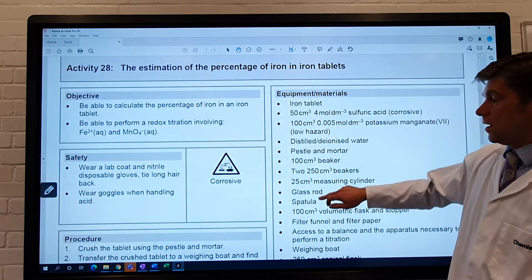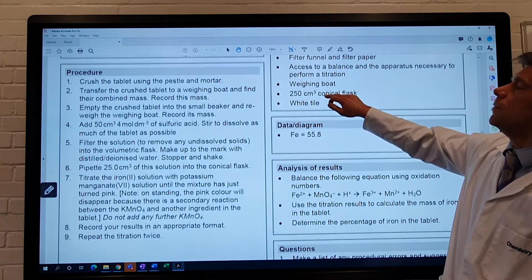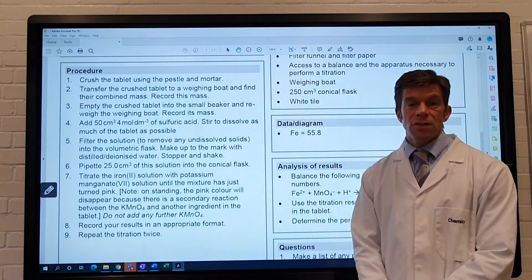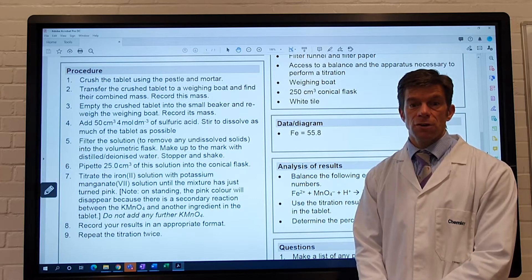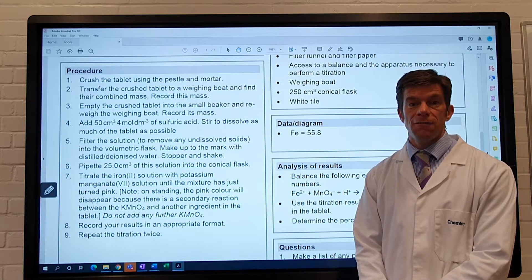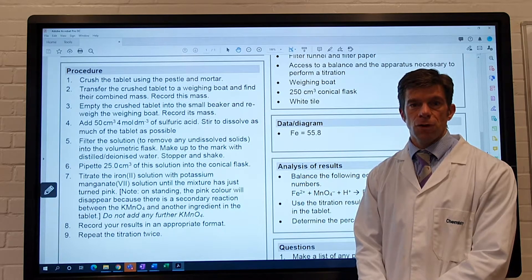The procedure for the experiment will be: crush the tablet using the pestle and mortar. Step 2, transfer the crushed tablet to a weighing boat and find the combined mass, and record the mass.